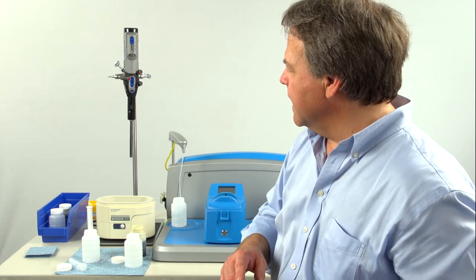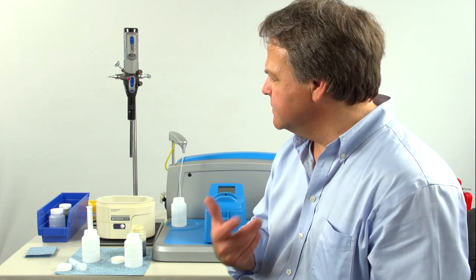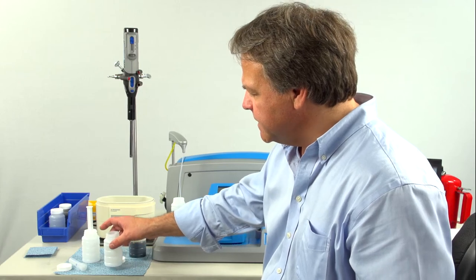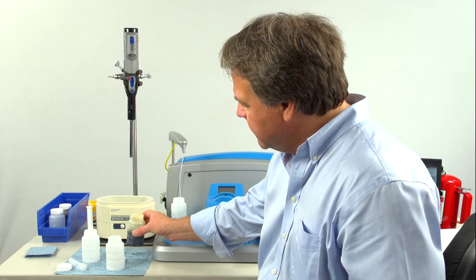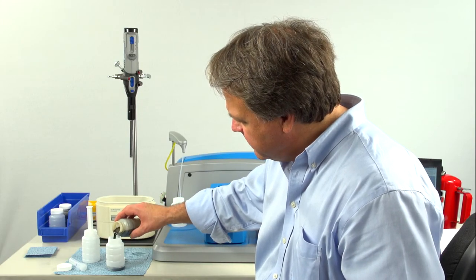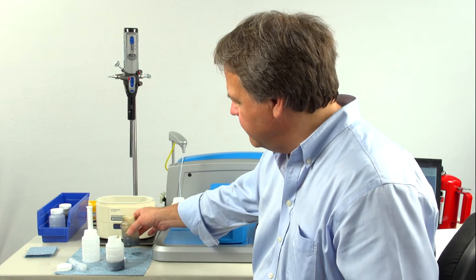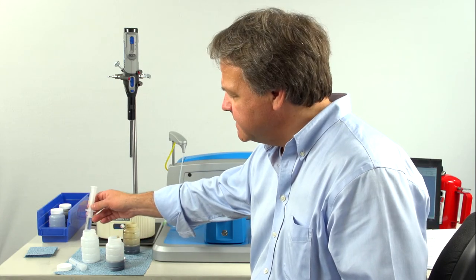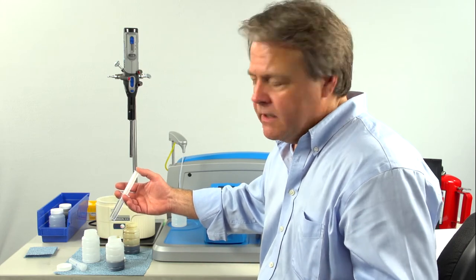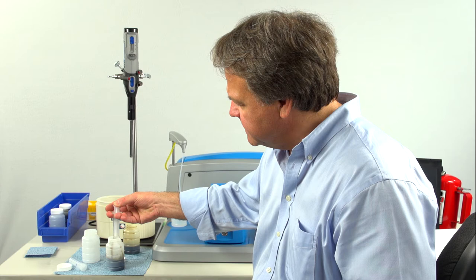We also offer, in the standard accessories and the consumables kit, consumables that are used to prepare the solvent for dilution. If you're using dilution, the straightforward way to do it, after you've shaken the sample to disperse the particulates, is to decant to the second line of the bottle, and then take a syringe with 10 cc's of solvent, such as lamp oil. You can use kerosene, lamp oil, Electron 22, really any traditional lab solvent to dilute, and inject your 10 cc's.